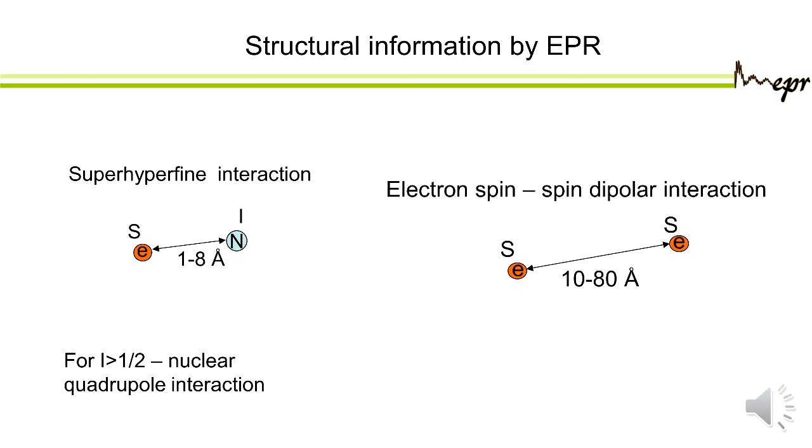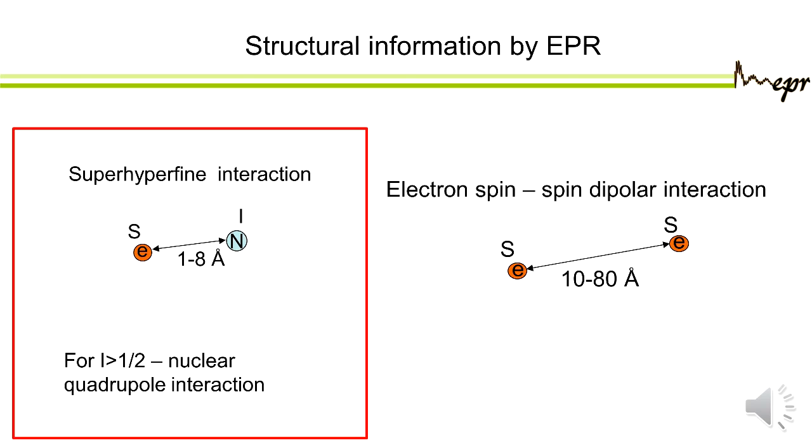So now we're focusing on the hyperfine coupling. Yesterday we went through continuous wave ENDOR that was mostly related to liquids, and now we go for solids.